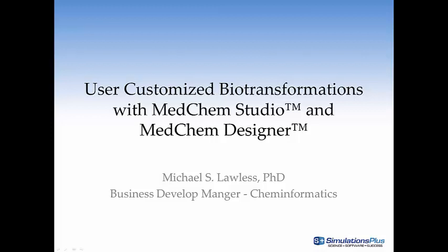Did you know that you can encode your own biotransformation reactions in Medchem Studio and Medchem Designer? Hello, I'm Mike Lawless and in this short video I'll explain how to encode a customized glucuronidation reaction.